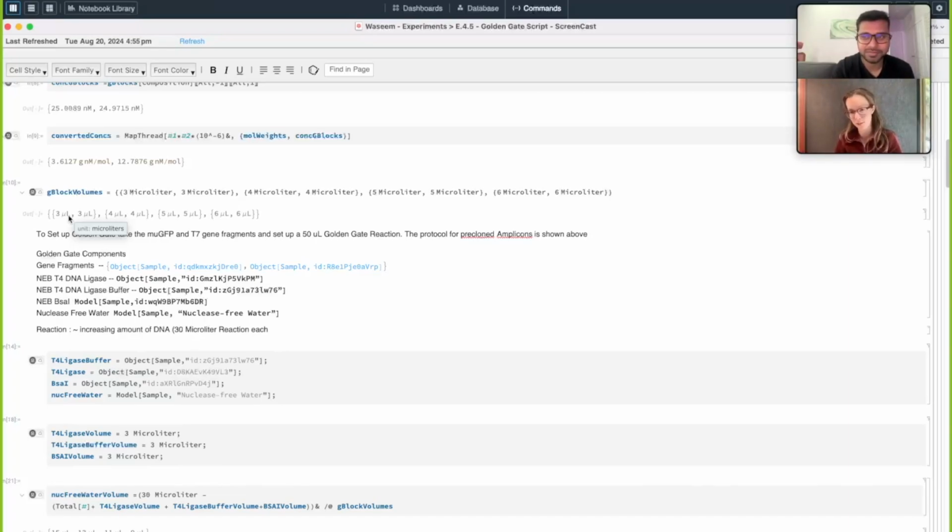Small volumes are tough to pipette reliably, but it's worth putting a flag on this: fiddling around with the reaction volume of this experiment was such a big deal that it literally appears in the final code as a series of options that are being tested out.